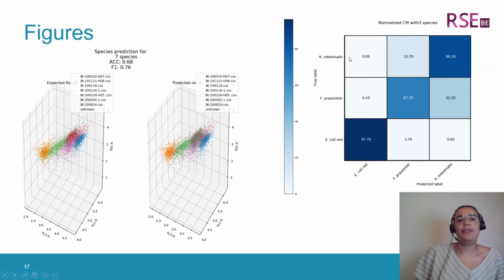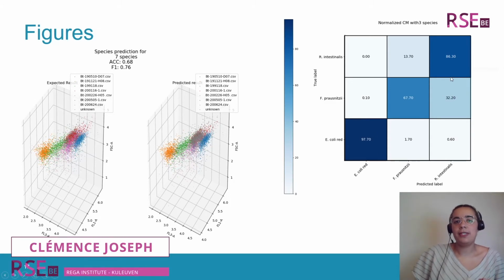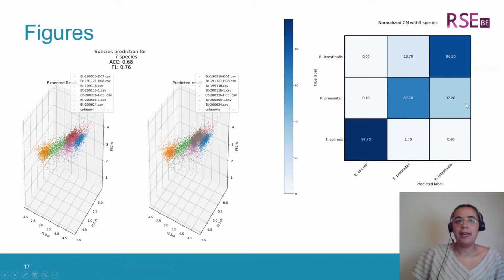Then the confusion matrix. It is really useful for the users. In case of the test or tool analysis function, the user can compare the expected result to the predicted values. The color gives the information right away. If the diagonal is dark blue, then the program can distinguish species. Outside of the diagonal, we can find the false positives and false negatives. Because sometimes users need the confusion matrix values, we added them in an Excel file with and without the normalization. Then the user can access them easily if needed.